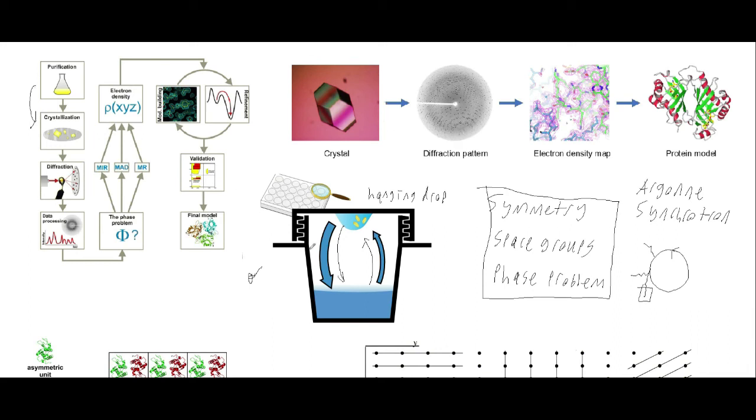And then what you get is a diffraction pattern that looks like this, or something like that. So that's what it shows here. Then once again, we have this phase problem, which, like I said, I don't know how deeply I want to get into, but there are methods for solving this phase problem.